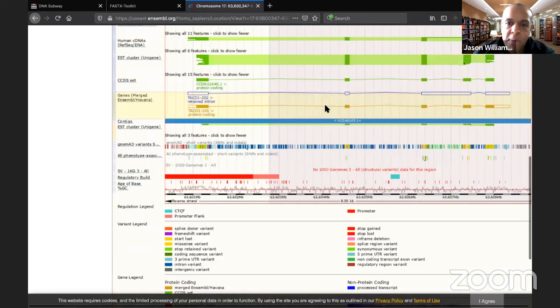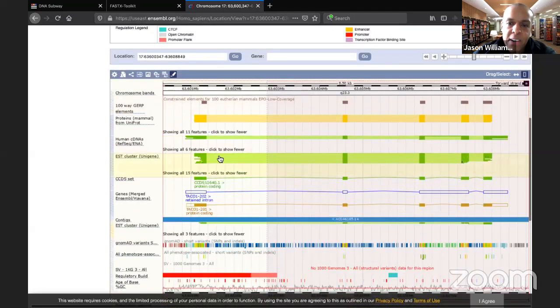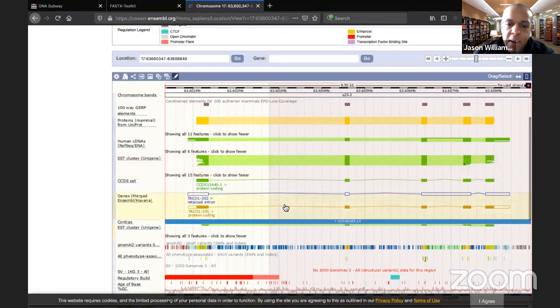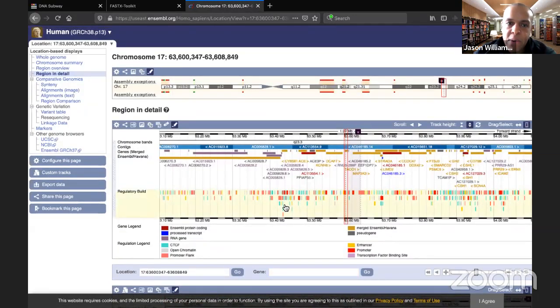This is very much what an RNA-Seq read looks like, where you imagine that this lighter part is an intron, and then you get actual reads where it's an exon. And there are all various things. Now, this is nice, and if I have a gene that I'm interested in, I certainly want to come back and view it in detail. But this data, I need to get it all at once.